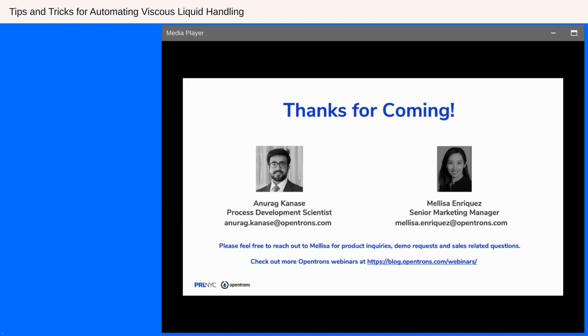If you want your protocols to be developed for handling specific liquids, our AppEng team is available, and these protocols can be handled pretty well only using the Python API. The protocol developer has some limitations at the moment. We are trying to improve the performance of the protocol developer. So the AppSense team will definitely be able to help you using the Python API.